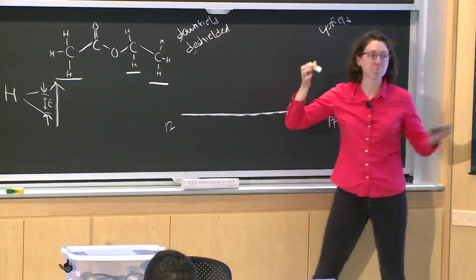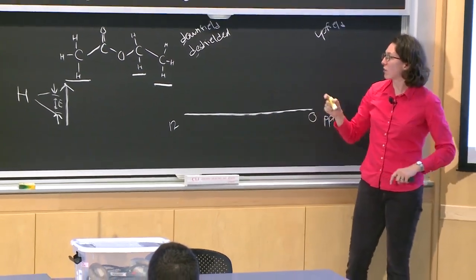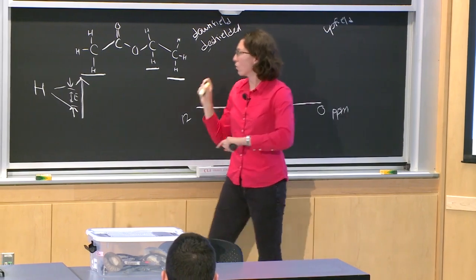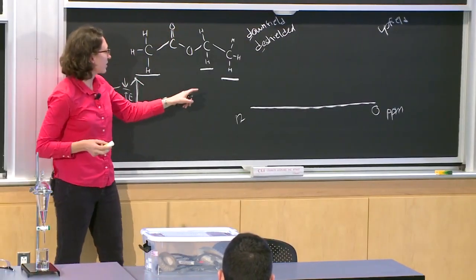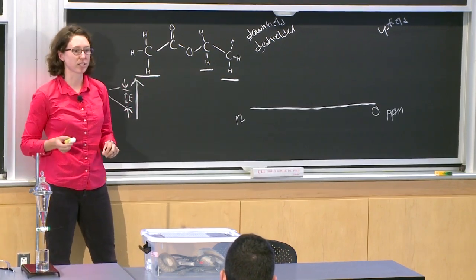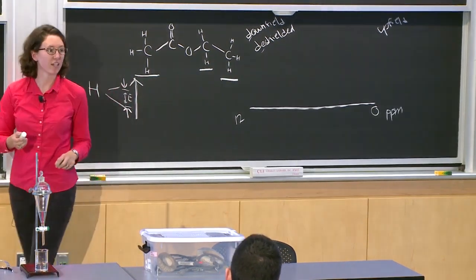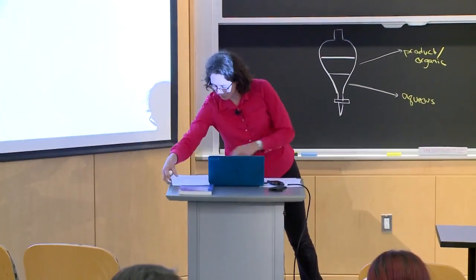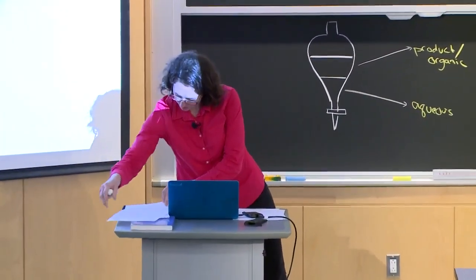Both start with D. And so if we look at these protons, which of these do we think is going to be the most upfield or the furthest away from all of our oxygens? Stuff all the way on the right? Yeah.